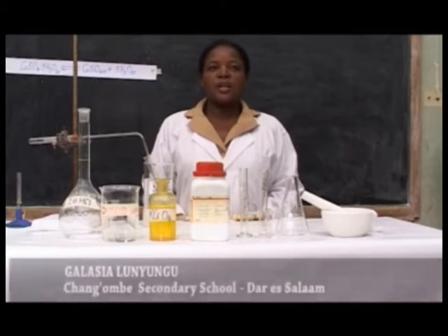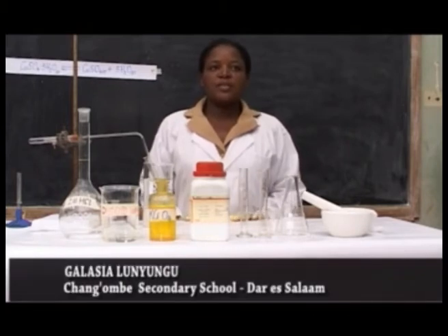There are chemical reactions in which the direction of chemical change can be easily reversed by changing the conditions under which the reaction is taking place. The aim of this experiment is to investigate reversible reactions by using hydrated copper II sulfate and potassium chromate solution.